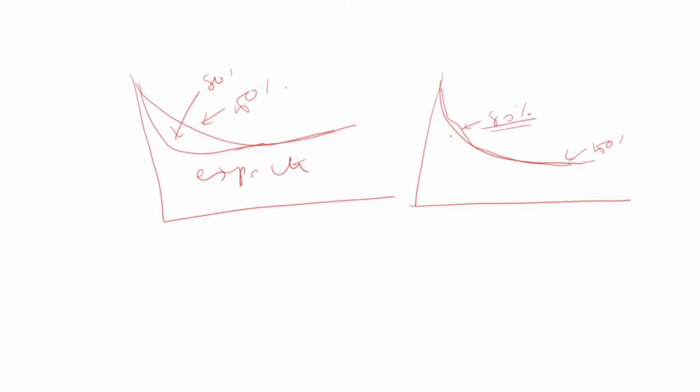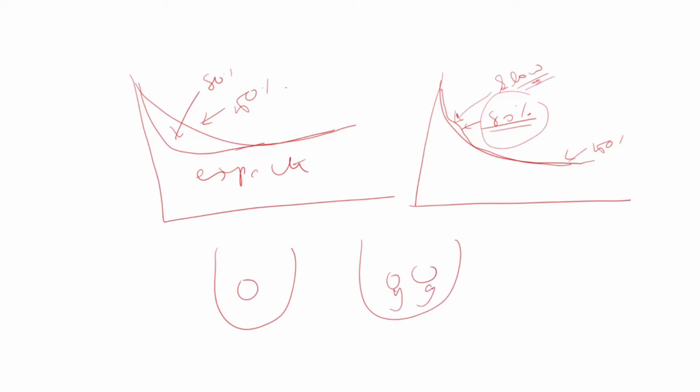So what it says is that when we have the higher seed loading, the depletion in the concentration is slow, which means slower kinetics. Normally the rule is that if you have more crystals, more mass will move to your crystals per unit time. So if you cannot expect this observation in the experiment, the only thing that we can imagine is that something happened in the experiment 1.